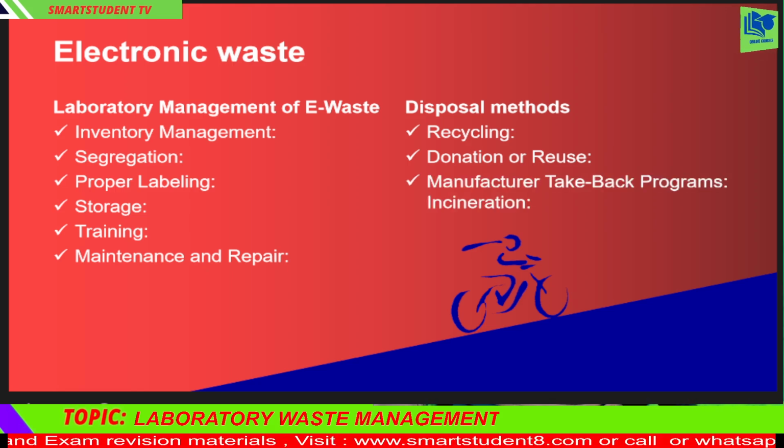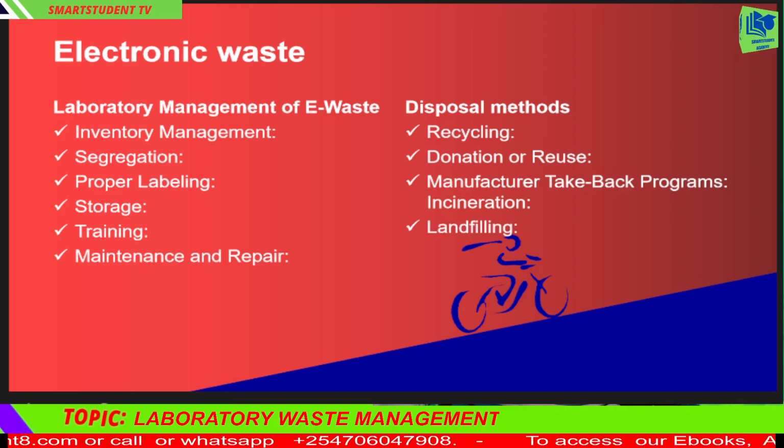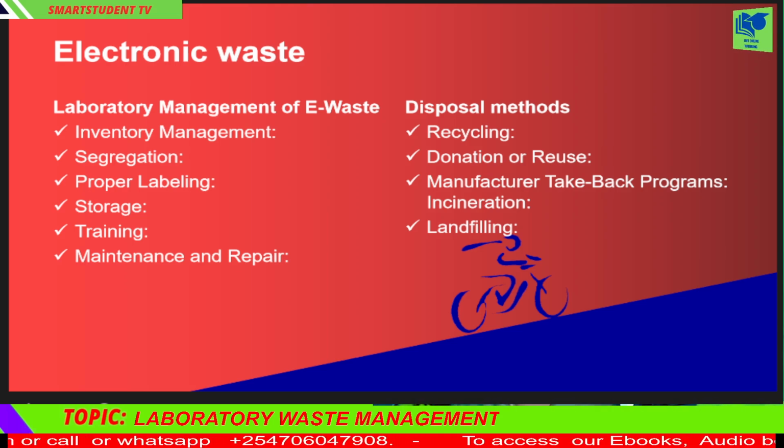3. Manufacturer take-back programs. Some manufacturers have e-waste take-back policies. 4. Incineration. Controlled incineration with proper filters can be used, though it is not the most environmentally friendly option. 5. Landfilling. This should be the last resort, and only in regulated landfill sites.